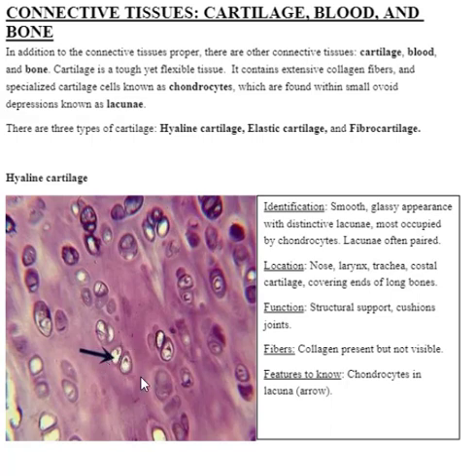This one's divided, so we're going to be expanding this tissue out a little bit. So now I'm going to have two cells. So this one's going to have to go off and make its own lacuna. Here's one in a lacuna. So the name of the thing that is laying down the cartilage is a chondrocyte. So these chondrocytes live in the lacuna, the little lakes.